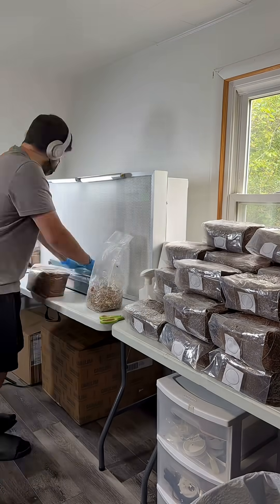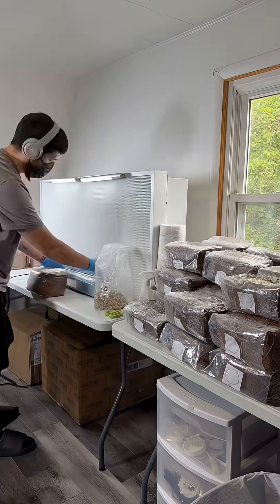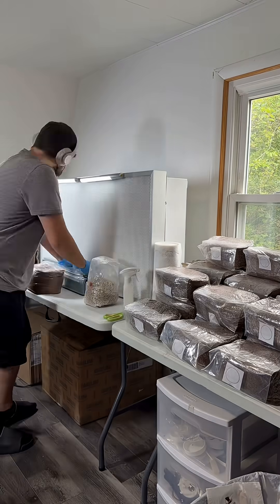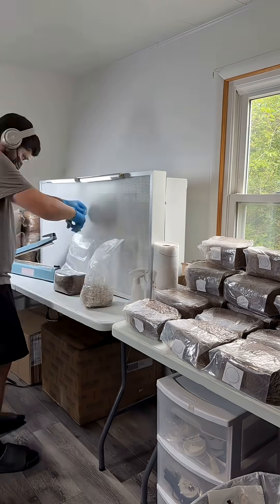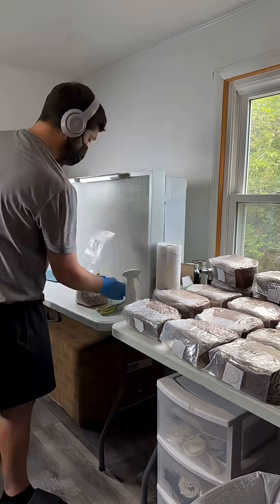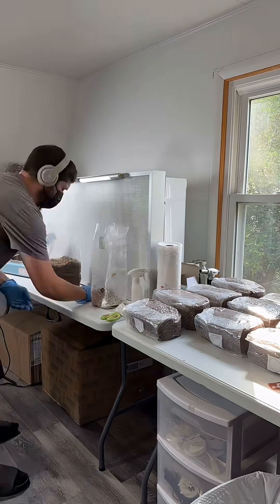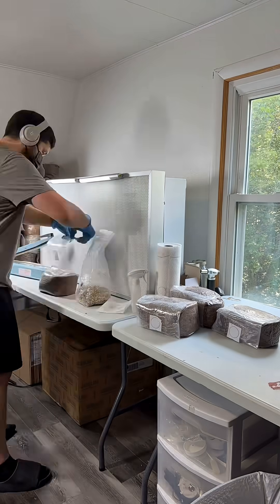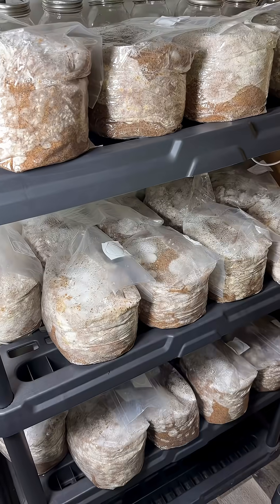This is a time lapse of me making 35 mushroom grow blocks. All I'm doing over and over is adding a little bit of the colonized rye grain to each of the sawdust bags, mixing it up, and then sealing it. I work in front of a laminar flow hood to make sure everything is clean. It only took four three-pound bags of colonized rye grain to inoculate all 35 blocks.